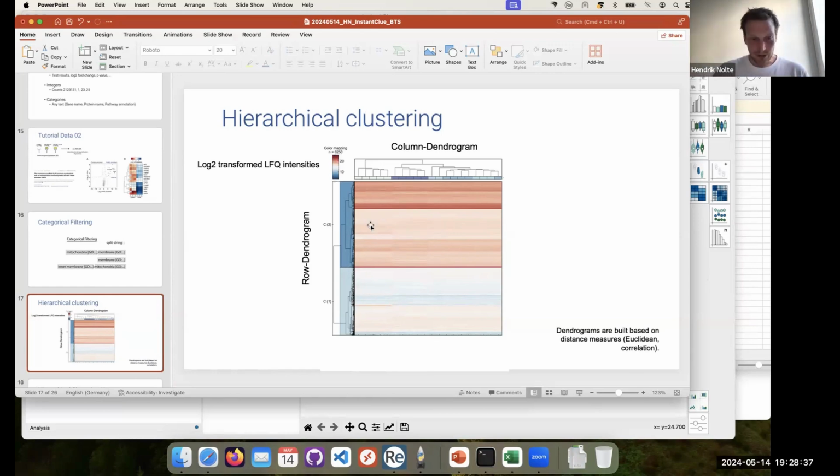And I just want to remind you, because I think heat maps and clusters are used extensively, it's very hard for the human brain to read quantitative value from color differences. So a heat map is used usually to show a global trend, not minor differences in the fold change, because that is very hard for the human brain to interpret.